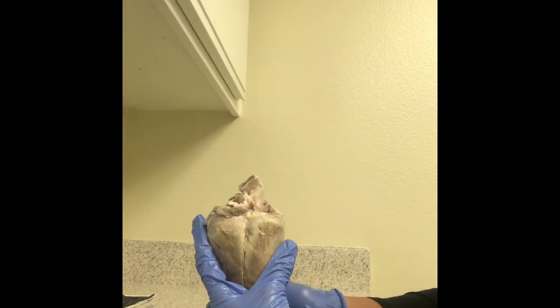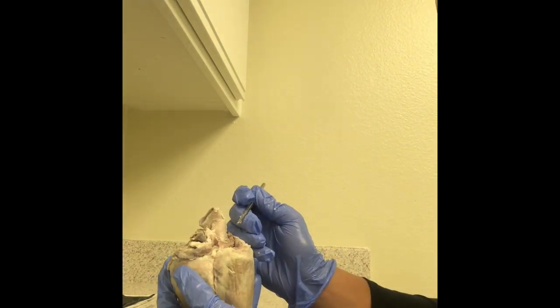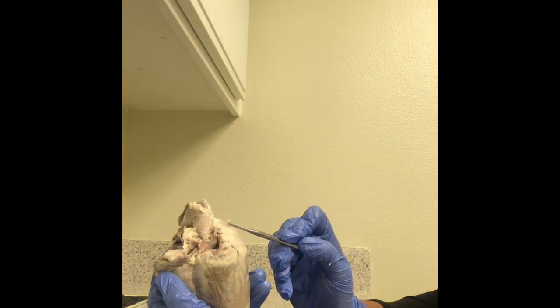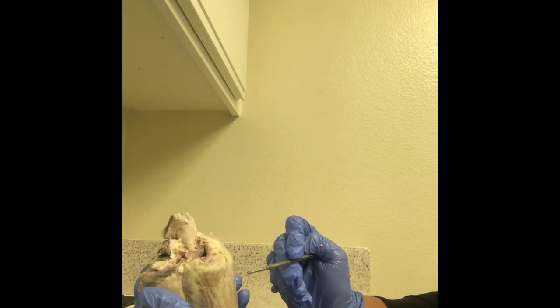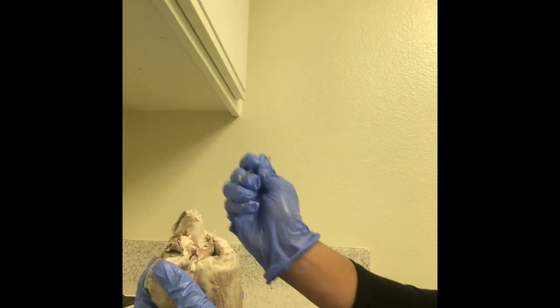I have the external posterior view of the sheep's heart. I chose to identify and locate the right auricle of the heart, as well as the superior vena cava. So the right auricle is right here on the heart. It is also known as the right atrial appendage. It is attached to the heart's right atrium, and it's a small cone-shaped pouch, which comes from the upper and the front part of the atrium, and it overlaps the root of the aorta.